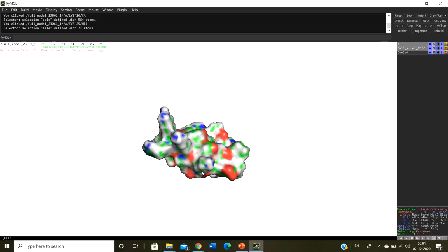So just by looking at it, you can know that it's not going to be the actual model. Because when you click on surface, you get a brief idea about how your protein looks, and generally proteins are globular. Not always, but generally, and so it does not have any abrupt structure.